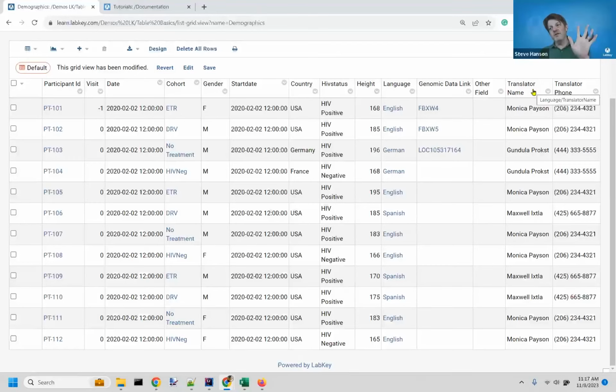And you could do the very same thing with your freezer samples and your assay samples. Kind of get them together in one grid just the way I've done it here. It's a great question. There's a number of ways to do it. Lookups, this lookup column is the easiest way to do it. Other questions out there?